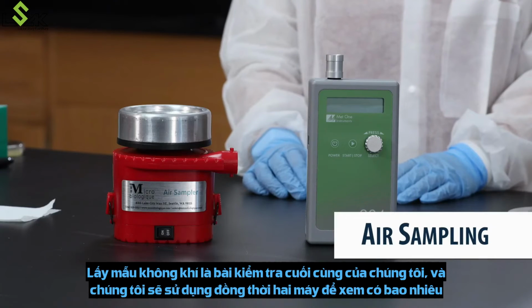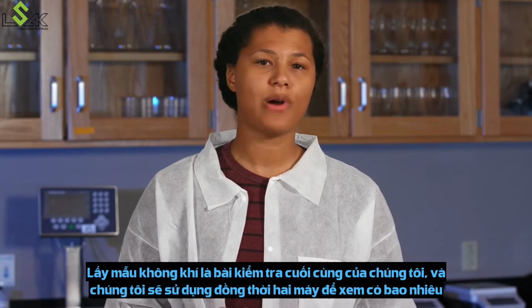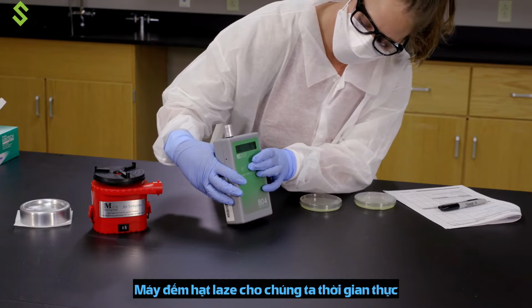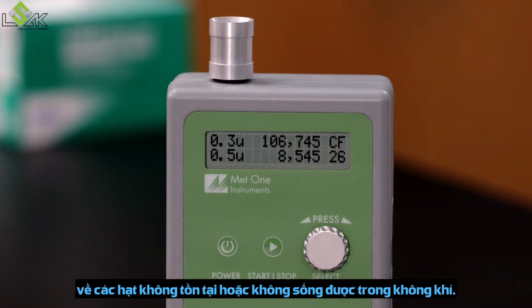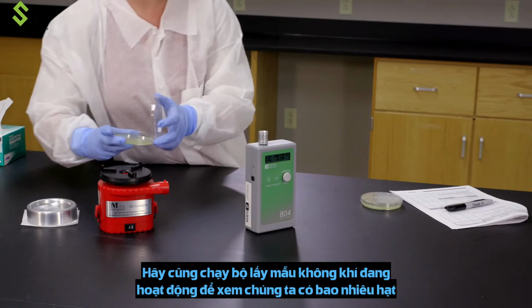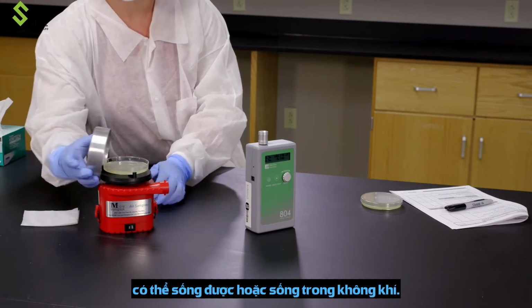Air sampling is our final test, and we're going to use 2 machines simultaneously to see how many particles are in the air at this workstation. A laser particle counter gives us a real-time readout of the non-viable or non-living particles in the air. Any particles will cross the laser beam and be counted. Let's also run the active air sampler to see how many viable or living particles we have in the air.